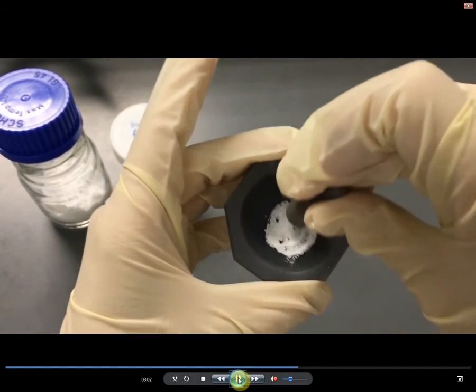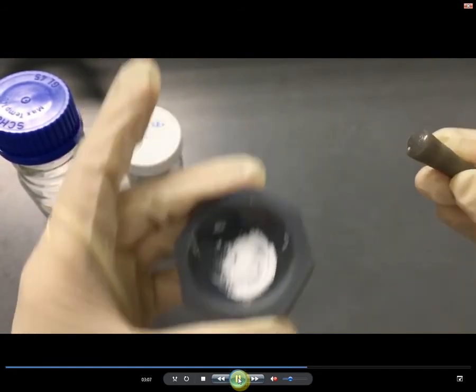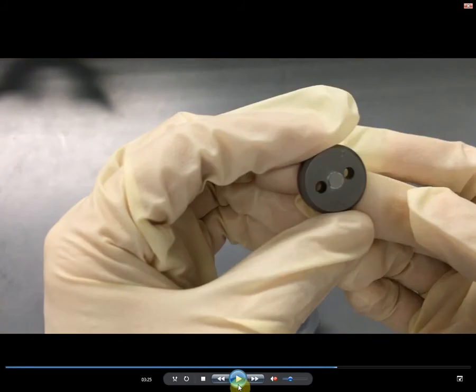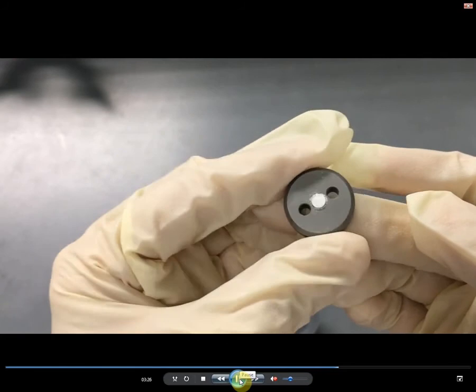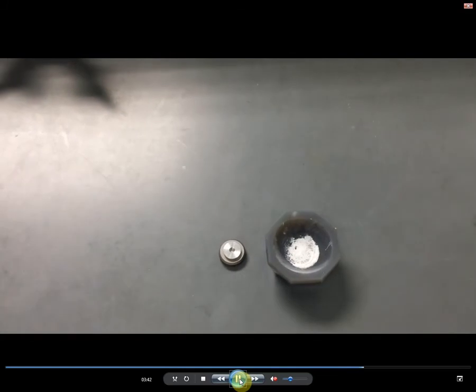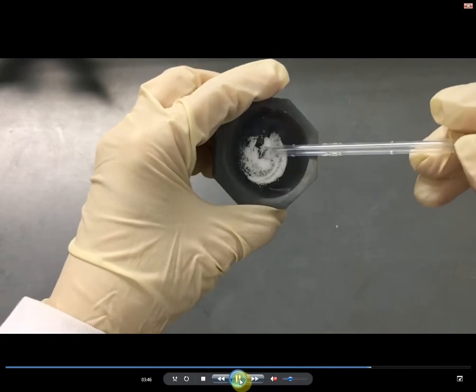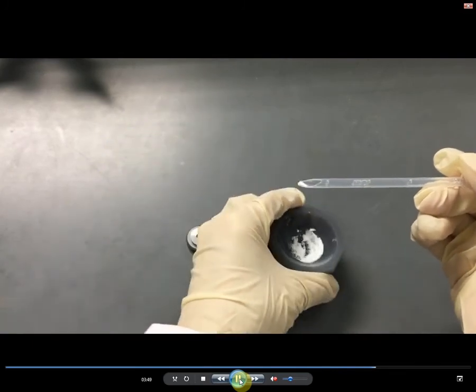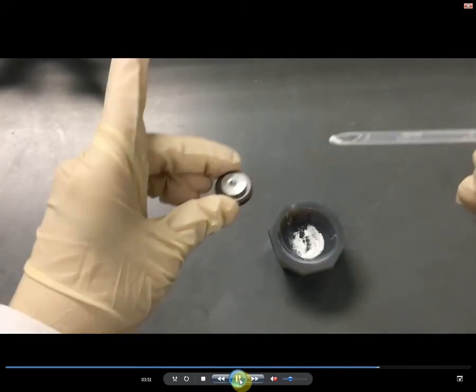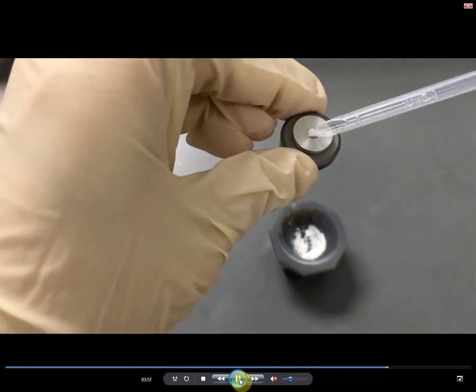Using the pestle, grind the mixture thoroughly using a circular hand motion and ensure that the mixture is fine and homogeneous. Next, assemble the lower cylinder and the frame together. Transfer the ground powder into the cavity in the frame. Ensure that the cavity is completely filled with the powder and the powder is level.